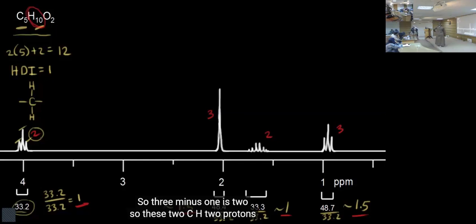So you consider this. These are all relative to what you consider as 1 proton. You have to assign either 1 proton or 2 protons first. Then the computer automatically integrates the others. Okay, so that is all related. Just write it down.